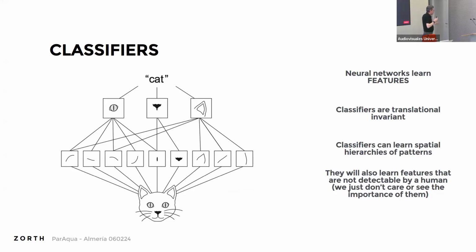Now, classifiers, actually, I showed you a little bit about the deep network, but deep neural network, how do they work? Here's a cat. We love cats in AI. Out of this cat, we're going to decompose the picture, and we're going to identify features. All right. So an ear can be an ear, the inside of the ear, but it can be also the contour.